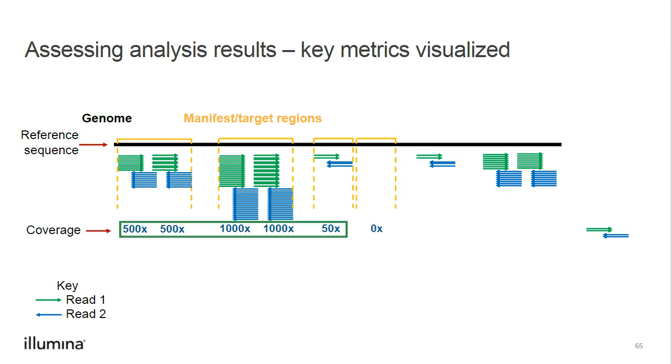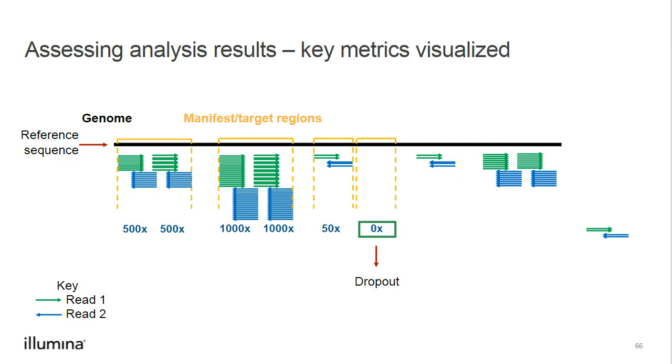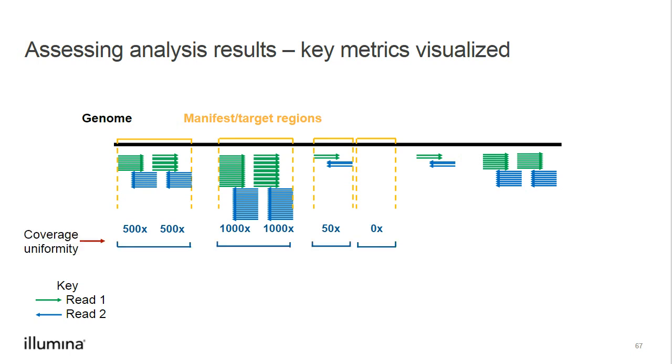Coverage refers to the number of reads for each panel target, or the reads per amplicon. Amplicon targets in the manifest that do not get any reads are known as dropouts. For our coverage uniformity calculation, we look at the reads for all amplicon targets and compare them. This metric will be calculated for you during the analysis.